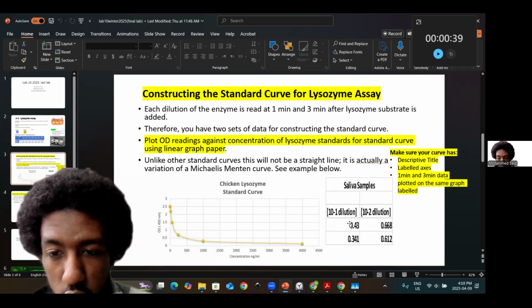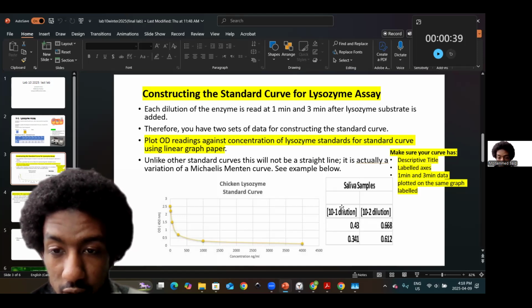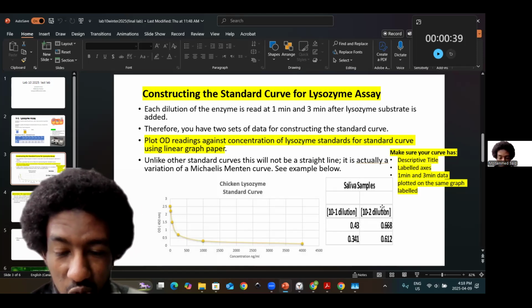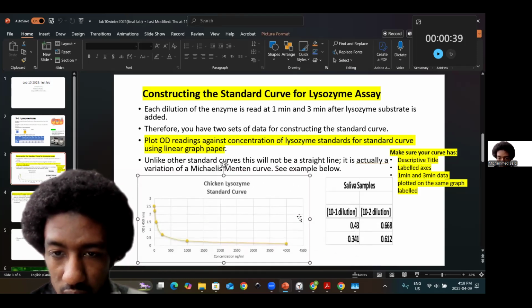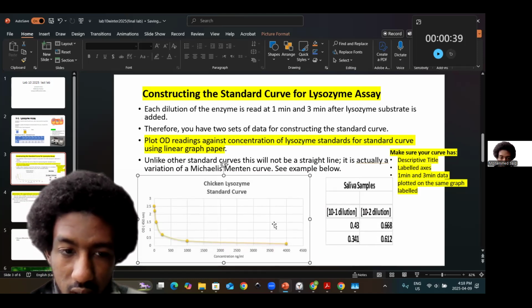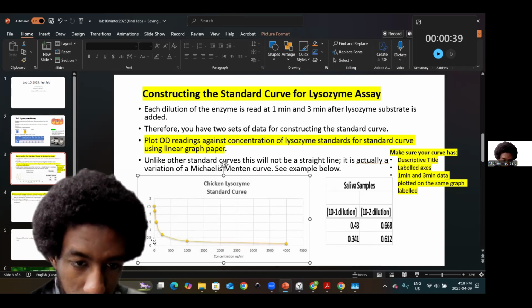This exists as patient 1, patient 2, and essentially serial dilution 1 and serial dilution 2. So think about it like this, and these other values depict your absorbance readings. So you would go here and look at the absorbance readings. Let's say 0.43.